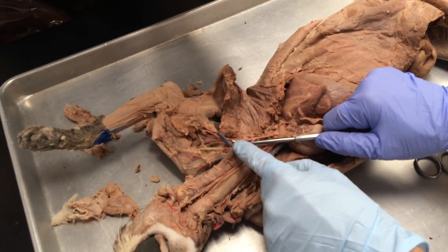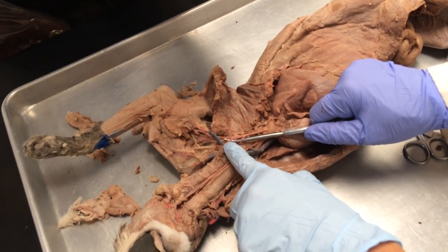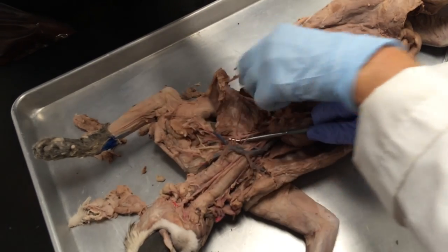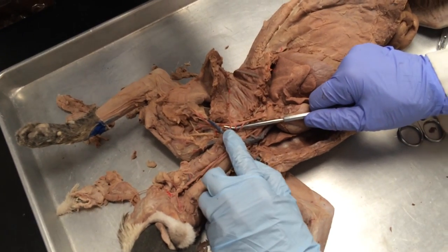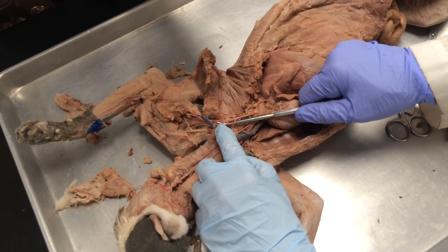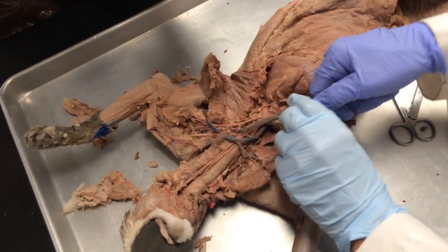Okay, very cozy trio. So the vertebral, the costocervical and the thyrocervical. Then opposite of those, we have the internal mammary. And you'll see it attaches to the chest wall. As soon as we go past the thyrocervical, this is now called the axillary. So the subclavian turns now into the axillary.